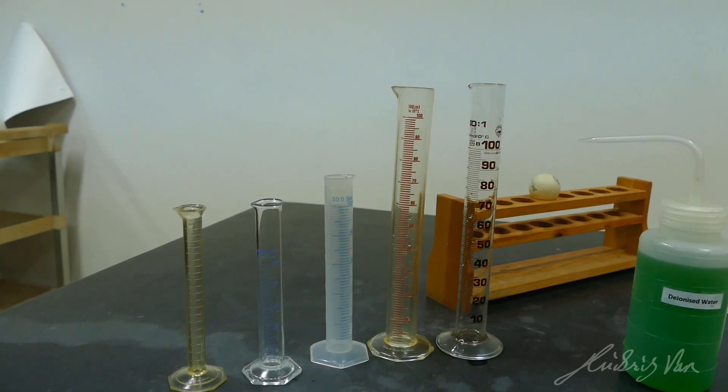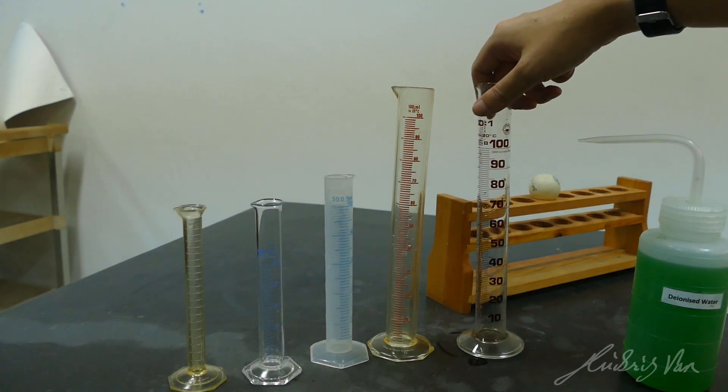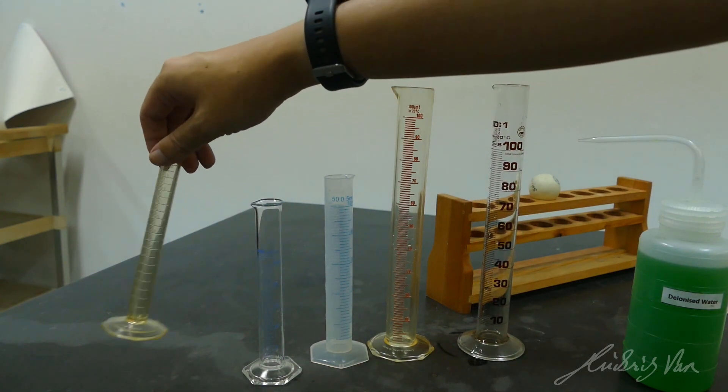Over here, I have five measuring cylinders. It's a common apparatus that you might be given for your practical. They come in many different volumes, for example, 100 ml all the way down to 10 ml.